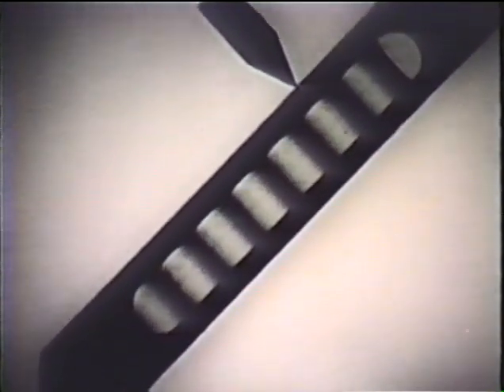If we know the wavelength of the light, the values for all these bands can be expressed in fractions of a millimeter using the scale engraved on the wedge.